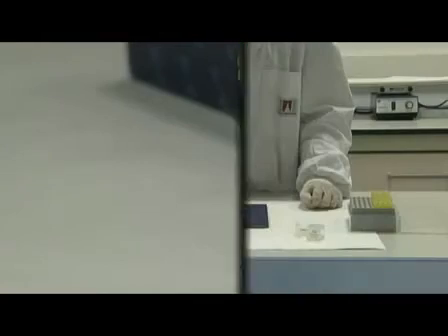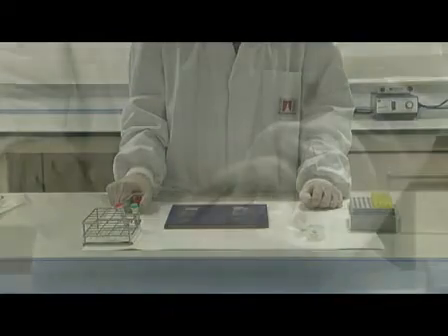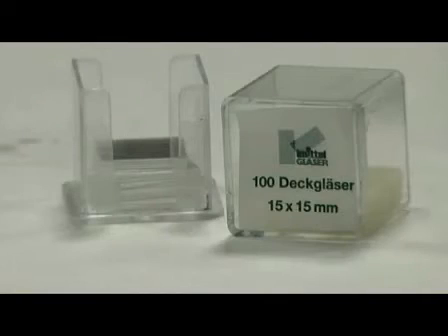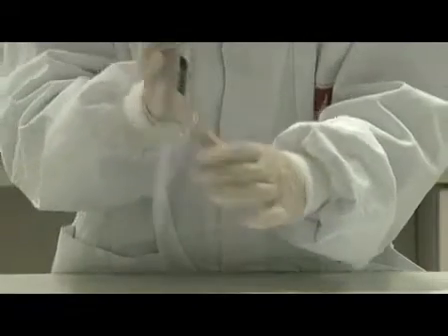The volume of the probe mixture added will vary according to the size of the area you want to hybridize. As a reference, for a 15 by 15 cover slide, a volume of 5 microliters is sufficient.